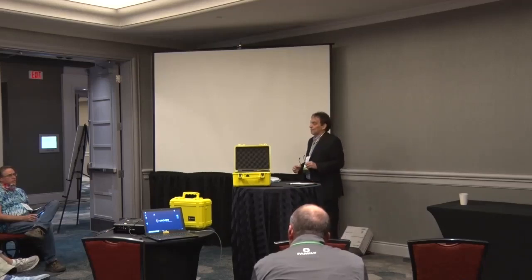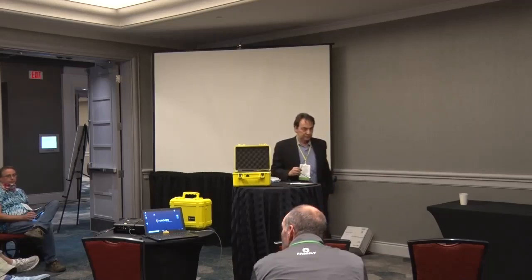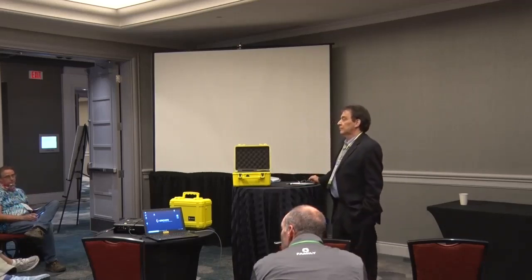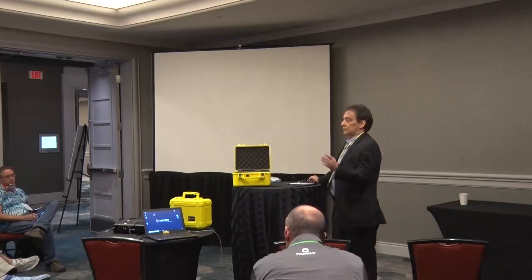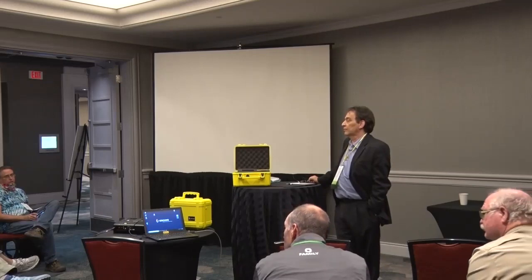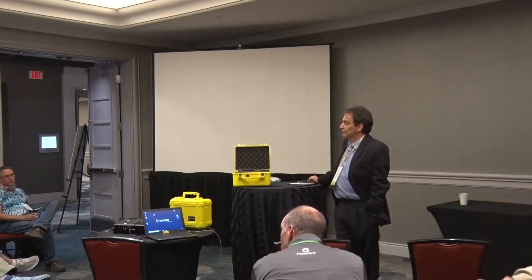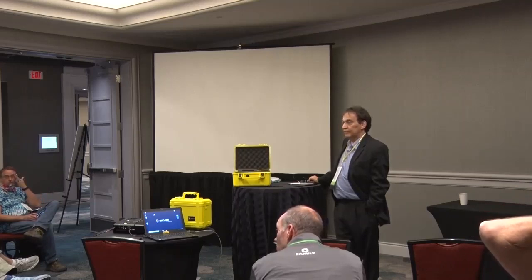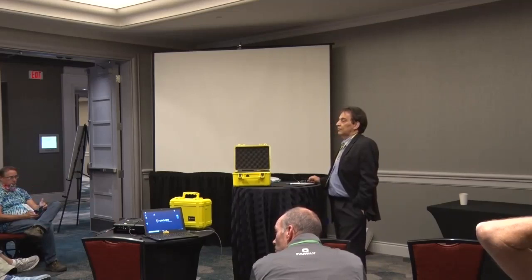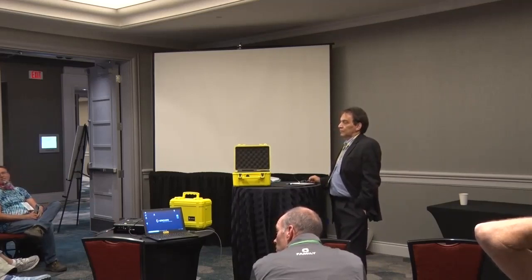You've got to fill the cell, and the flow is about half a liter per minute. The cell's about a third of a liter, so in 15 seconds or so it fills. So you've got about a minute there for the air change within the cell itself. As it's counting up, you want to wait until the count stabilizes. That's what you're reading. If it's still going up, don't move suddenly on to something else, because it might spike really high.